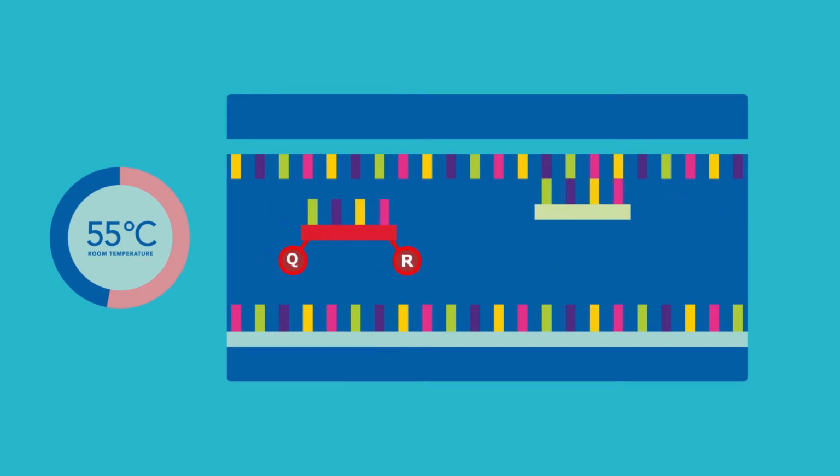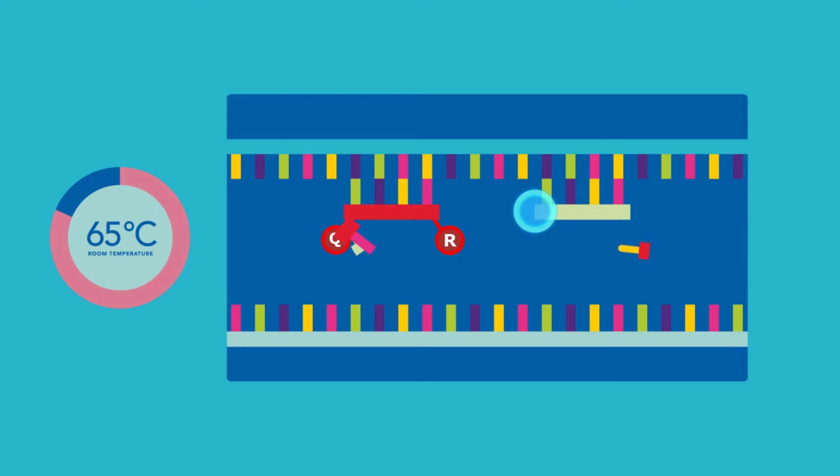Probes, labeled with both a reporter molecule and a quencher molecule, and sequence-specific primers anneal to the single-stranded DNA template. During this cycle, DNA polymerase attaches to the primed template and begins to incorporate complementary nucleotides. Finally, during extension, the temperature slightly rises to 65 to 75 degrees Celsius.